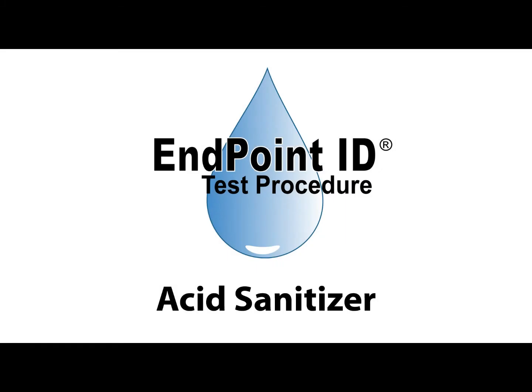This is a demonstration of the acid sanitizer drop count test kit using endpoint ID procedures. Please refer to the instruction sheet while watching this training video.